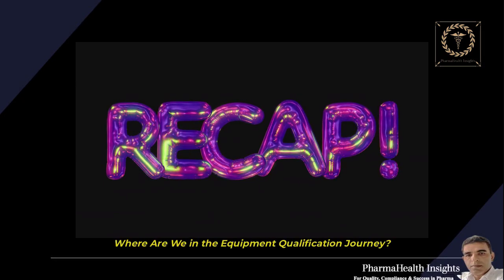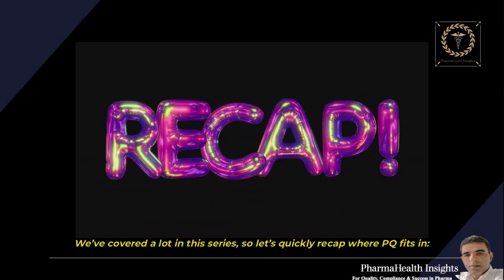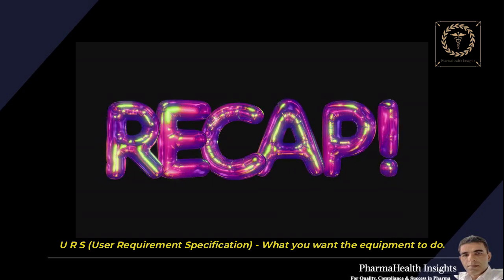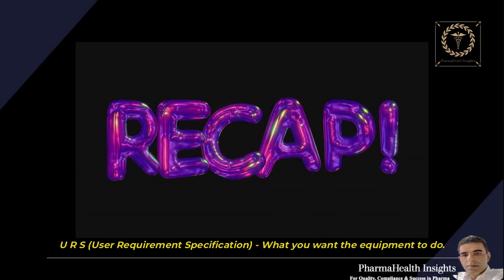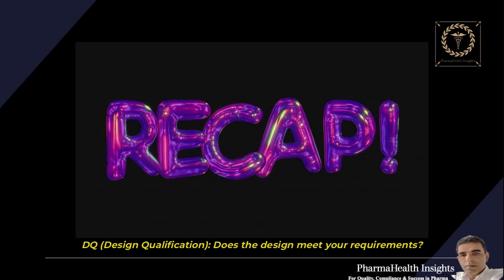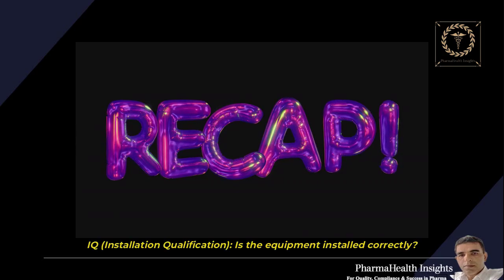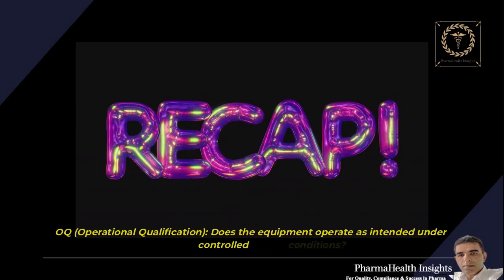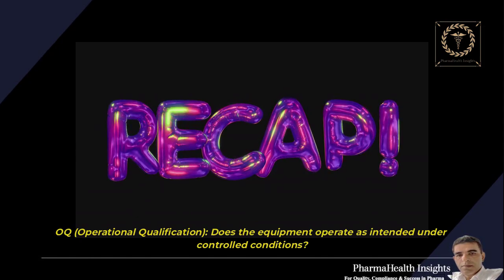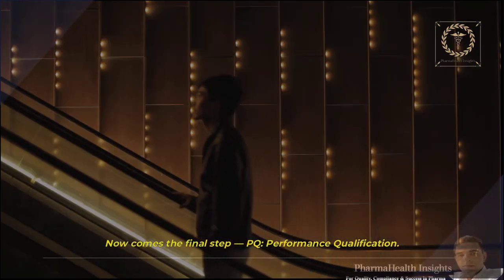Where are we in the equipment qualification journey? We've covered a lot in this series, so let's quickly recap where PQ fits in. URS, User Requirement Specification. What you want the equipment to do. DQ, Design Qualification. Does the design meet your requirements? IQ, Installation Qualification. Is the equipment installed correctly? OQ, Operational Qualification. Does the equipment operate as intended under controlled conditions? Now comes the final step, PQ, Performance Qualification.